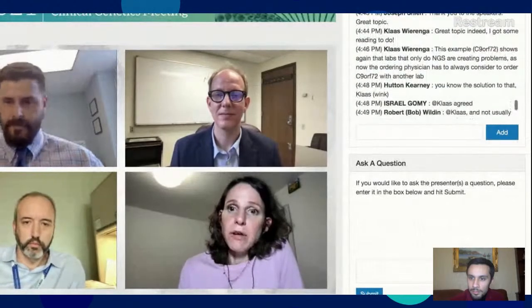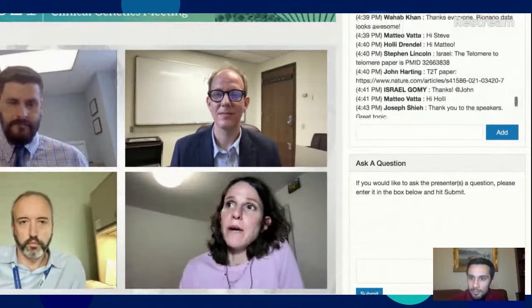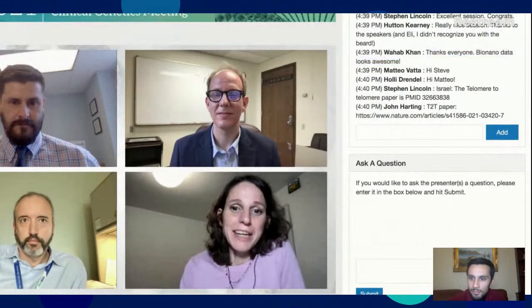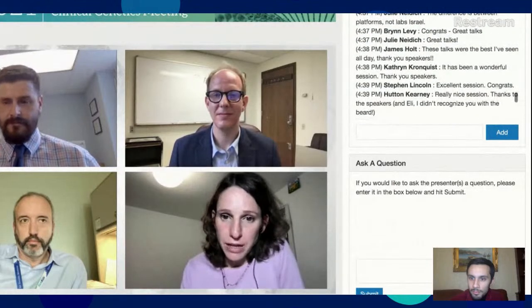And so because ExpansionHunter was the only one that was able to genotype repeats that are larger than the read length, and because some of the expansions in the pathogenic range are larger than the read length, we've decided we're going to use ExpansionHunter.